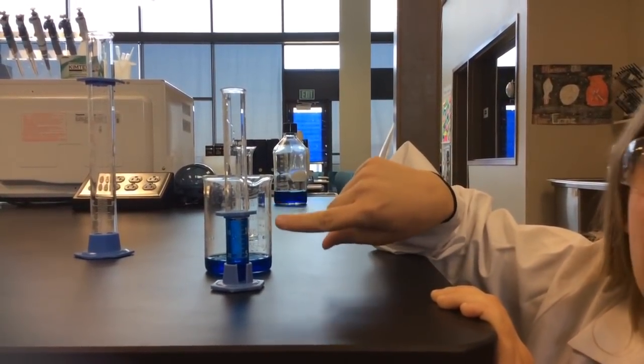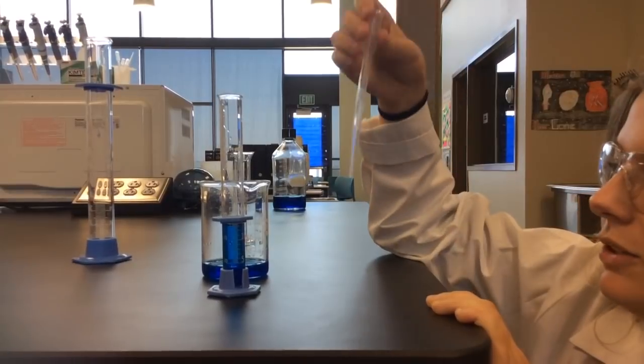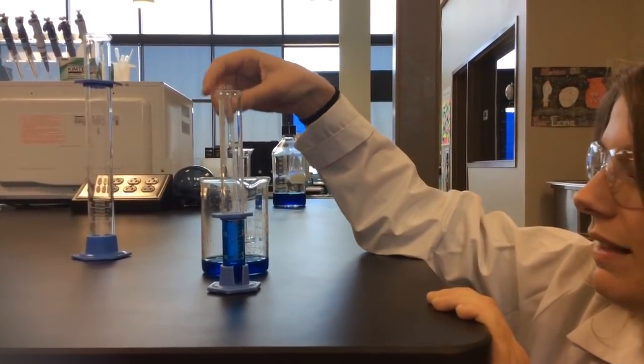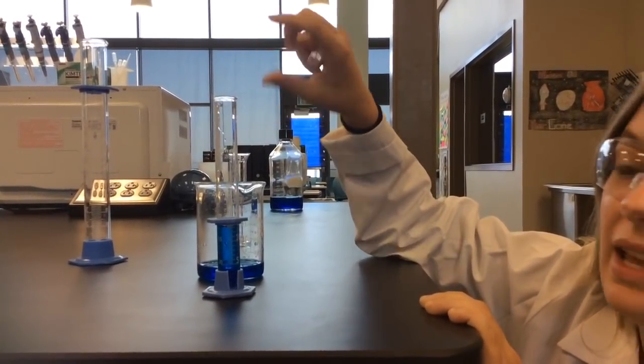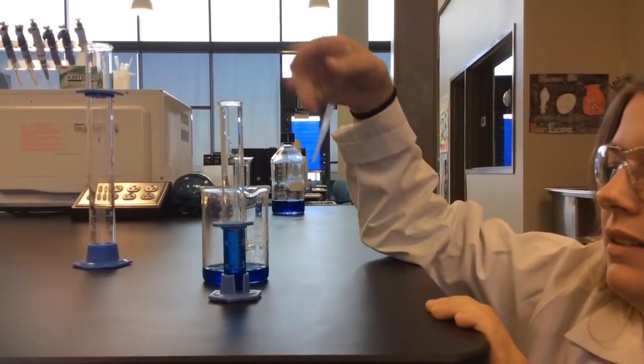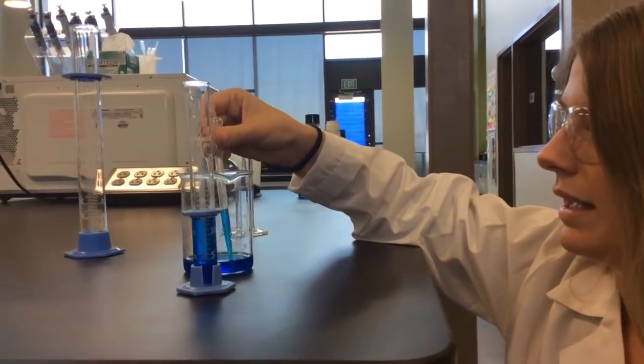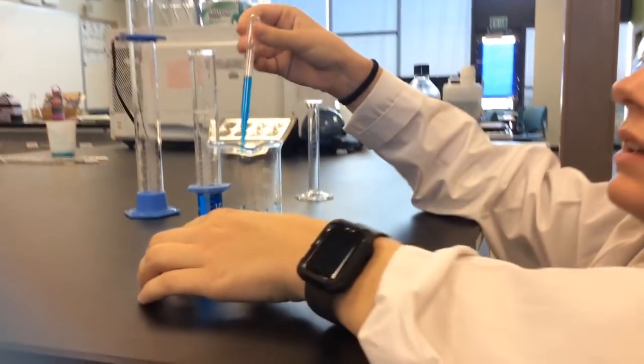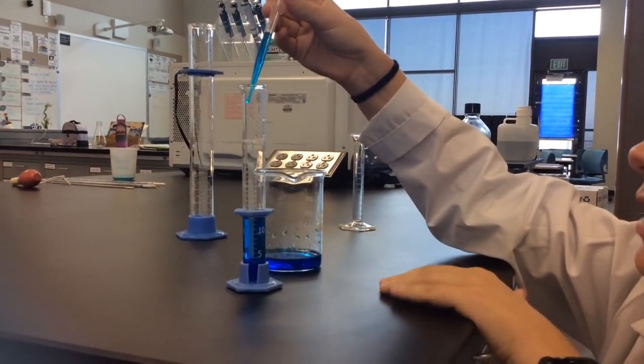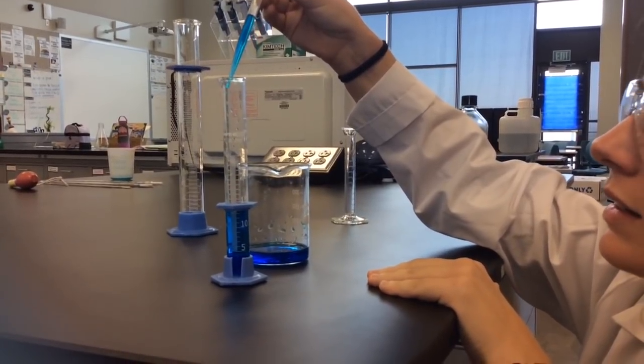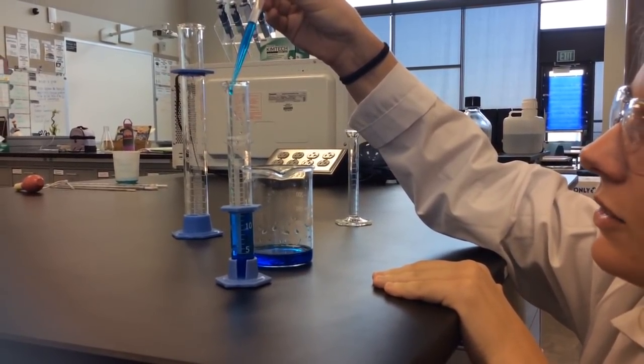So you pour really closely to what you want it to be, and then use a transfer pipette to get the last little bit. Because if you just pour it in, it's going to go way over, and then you have way too much solution. So what we can do is, with this, pick up some solution and carefully just do drops until we get to what we need.